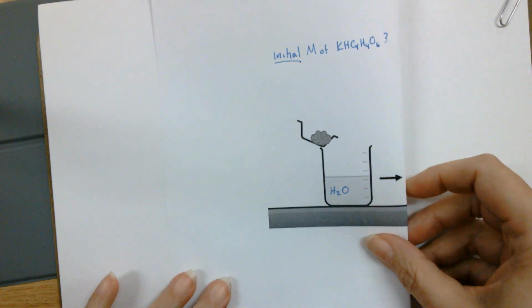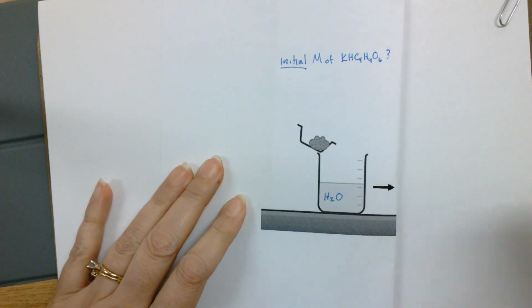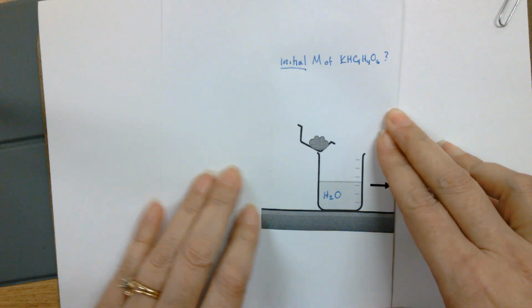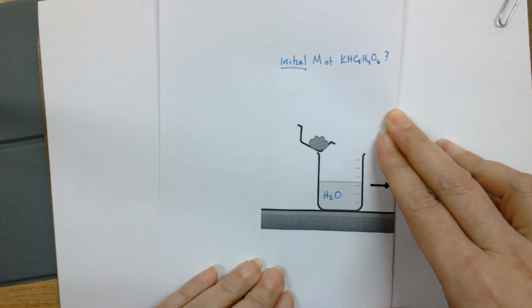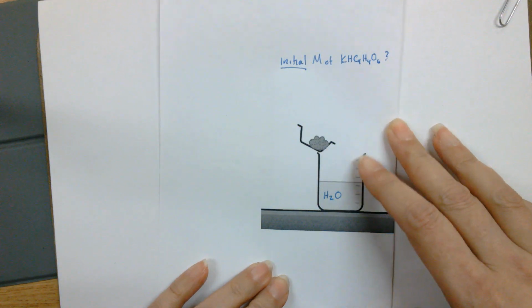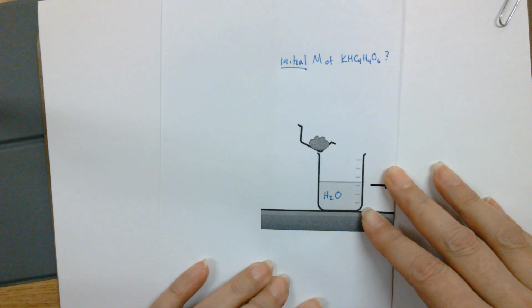So let's just think about what we were doing. There was something I did before you came into the lab. I needed to make this saturated solution of the potassium hydrogen tartrate. To do that, I measured out some potassium hydrogen tartrate in a weigh boat, and I put it into a big beaker full of plain deionized water.